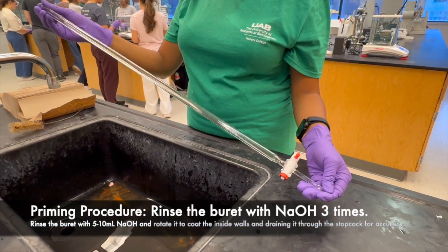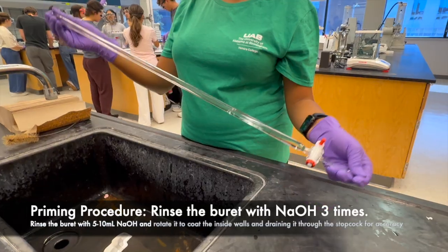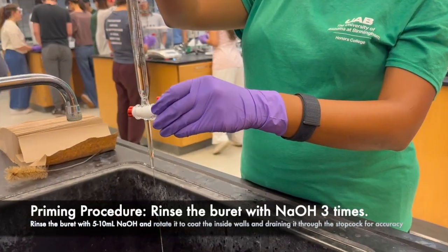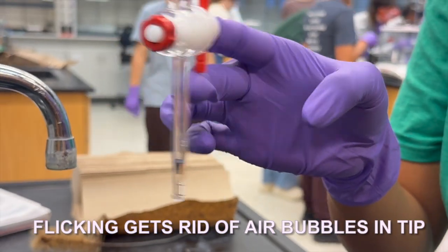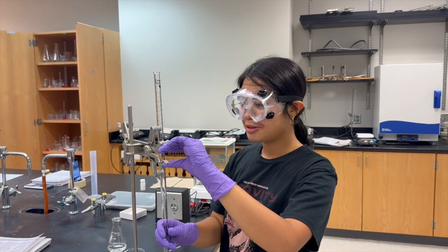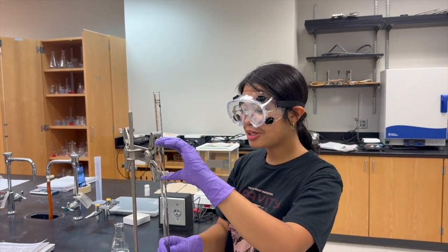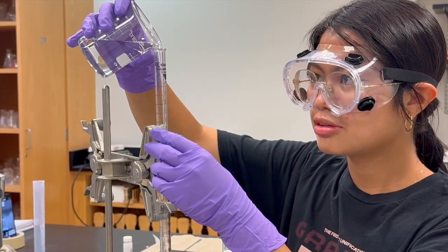After rinsing with water, prime the burette with NaOH. Do this by adding a small amount of NaOH and tilt and rotate it to coat all inner surfaces. Then drain the solution. Repeat this process 3 times. Place the primed burette in the clamp in a position where the desired volume is at eye level. When adding the solution, you should not be adding it above your head. Add sodium hydroxide to the burette.